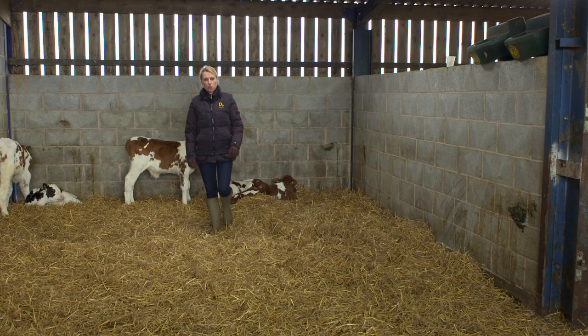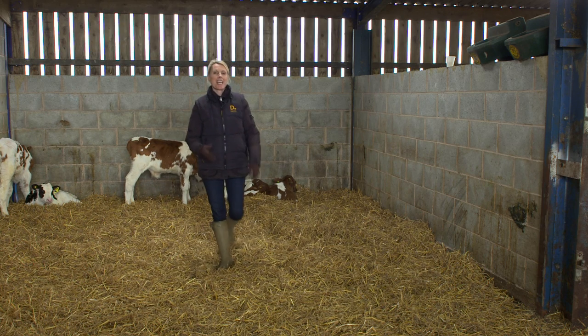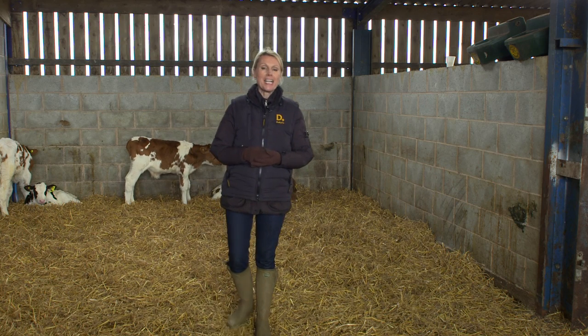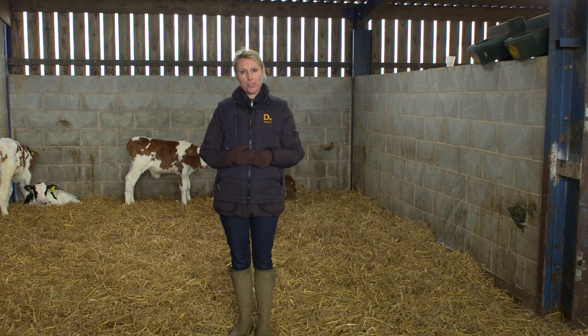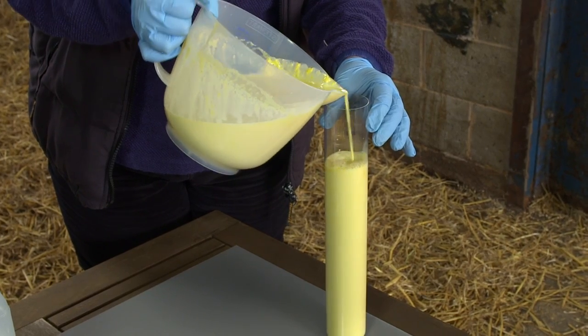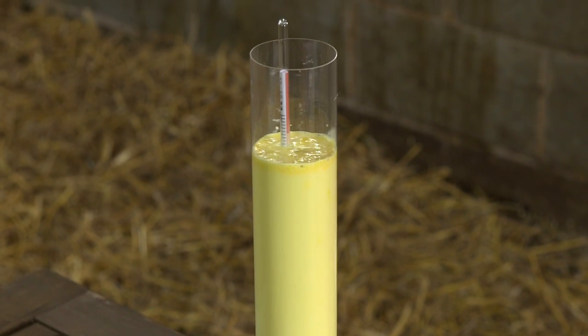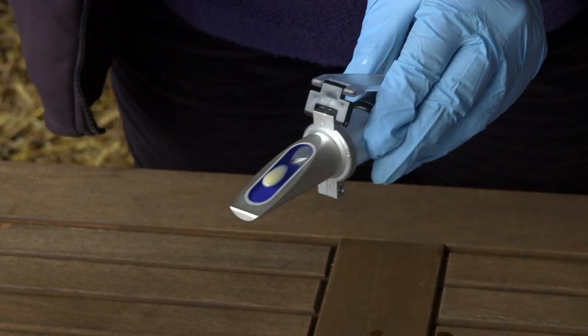One of the best ways to ensure successful colostrum management is to test the quality of colostrum on farm. It can be easy, affordable, and the health and productivity of our calves is worth the effort. In this film, part of Dairy Co's calf management series, we look at why and how you should test the quality of colostrum. I'm joined now by Sarah from Dairy Co.